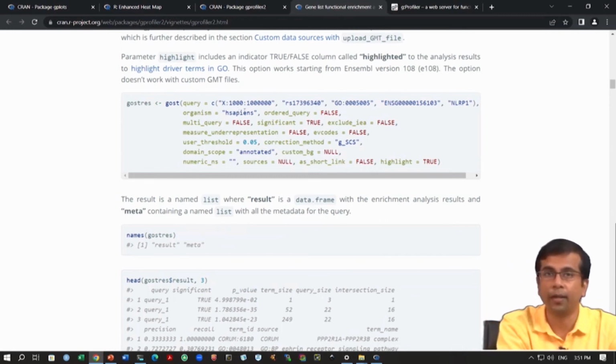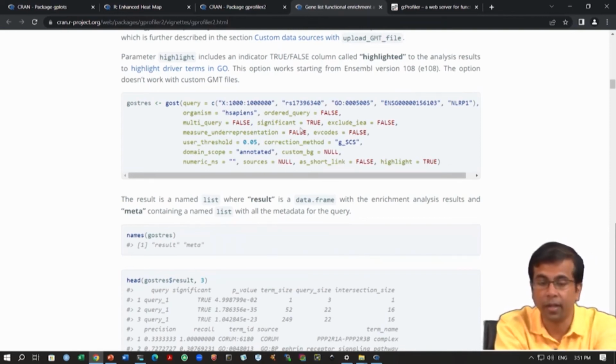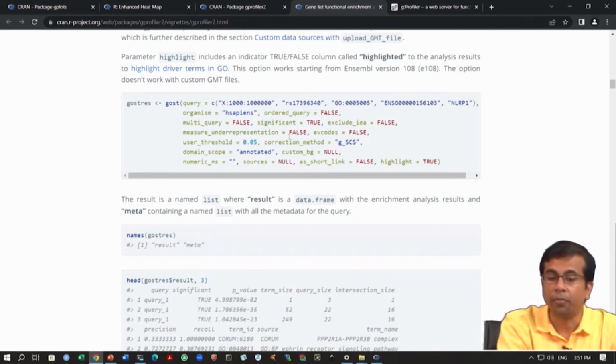Sapiens, this is the human data. Where we are working with Saccharomyces cerevisiae data, we can simply say S. cerevisiae. These naming conventions are also given in another page, we will see in a moment. Then you also have different attributes that you can use.